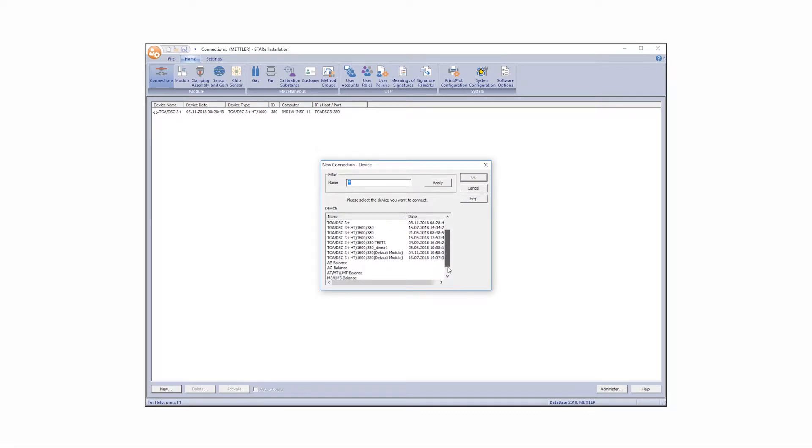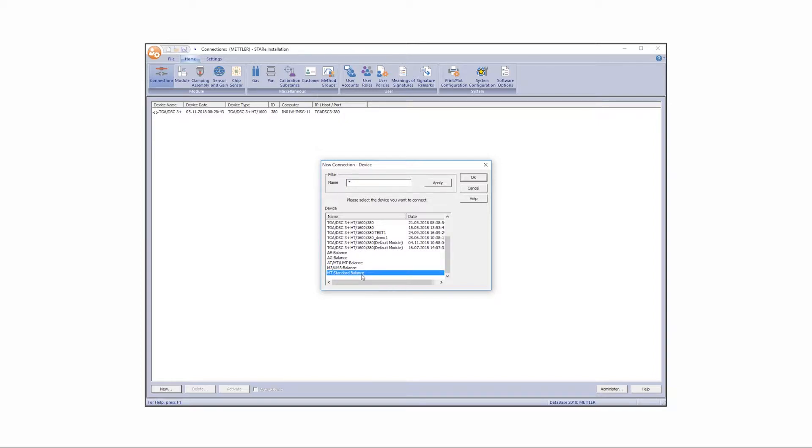Select the desired balance from the dialog box. In this example, we are using a standard Mettler Toledo balance. Click OK.